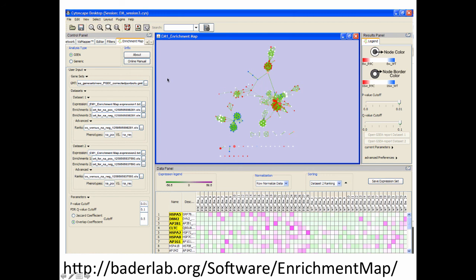Enrichment map is a Cytoscape app - you should have all installed it. It allows you to create enrichment maps from GSEA data, from G-Profiler, or from other tools. There's a heat map functionality; if you have GSEA data, the leading edge is colored in yellow. There's also a slider bar to change the Q-value cutoff, and as you change it the enrichment map updates. I like to make the Q-value cutoff really stringent first to see what functional themes are most significant, then make it less stringent to see other themes popping up. That lets you get a sense of which themes are most robust.